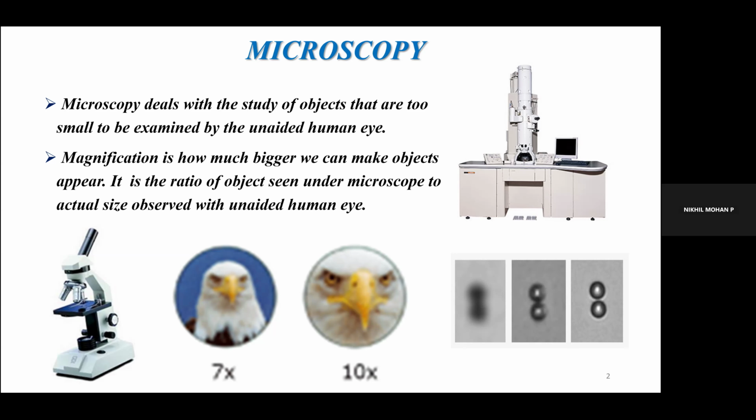if we think about the resolution, because here we are using transmission electron microscopy for the analysis of nanomaterials. So we will consider a particle a nanomaterial if its size is about 2 to 100 nanometer. So if we want to visualize this kind of material, we should have that much resolution.